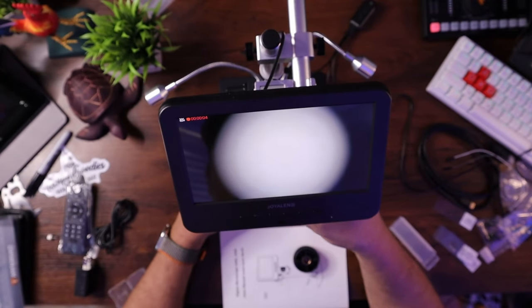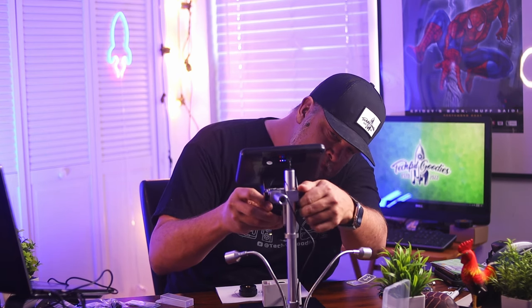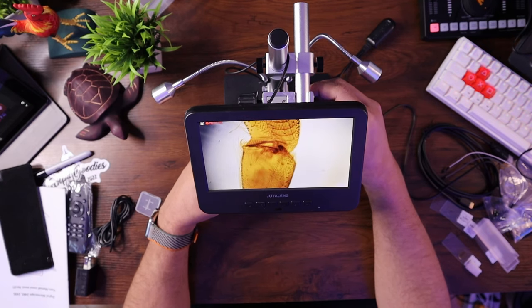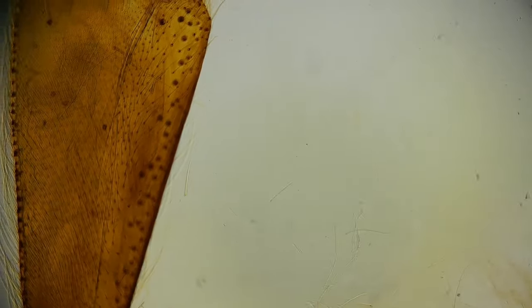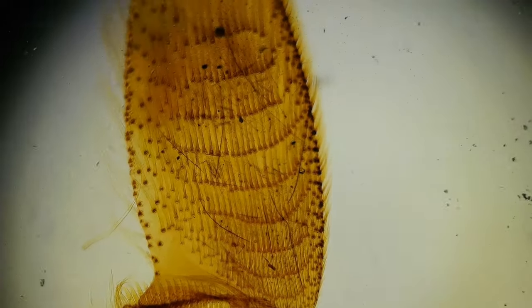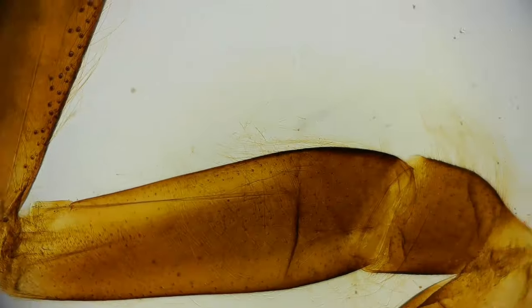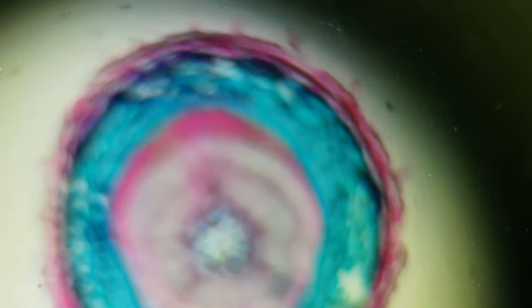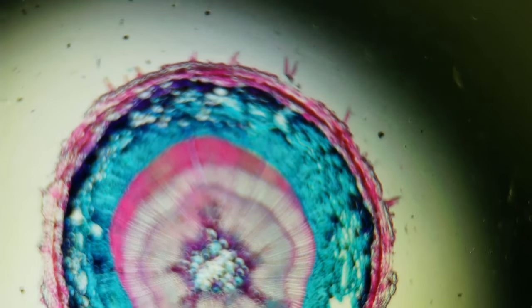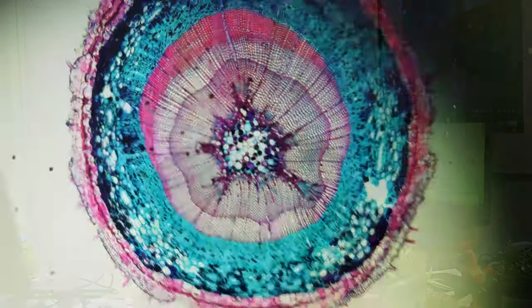Now you can see we are focusing really close here. They suggest sliding it all the way down as close as possible. Look at that — this is a honeybee worker leg! It's so close. These are the slides they gave us. Wow, this is going to be incredible for my kids when they do school projects and can record this and zoom in on stuff like that. Now let's look at some of the other ones — this is a cross section of a pine stem. That's amazing. I'm going to lose myself in this video; I'm basically just going to be staring at this stuff all day. This thing is incredible, and the fact that you can hook it up to your computer and record exactly what you're looking at.